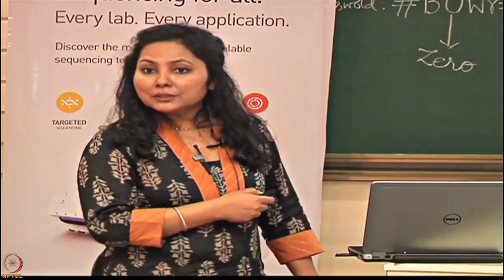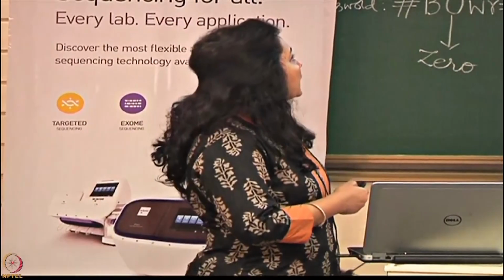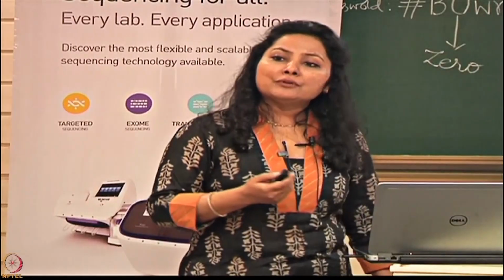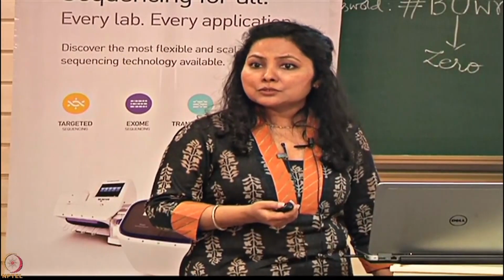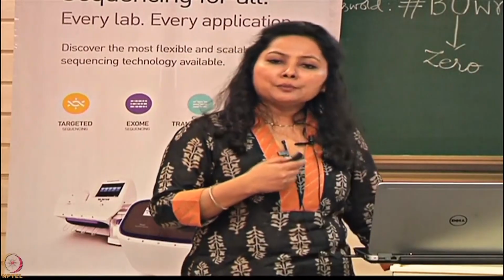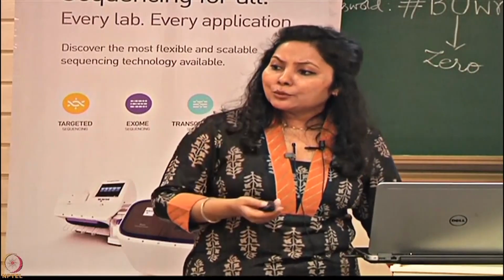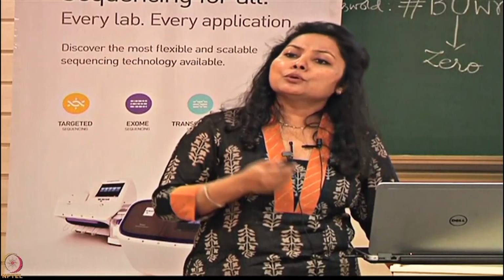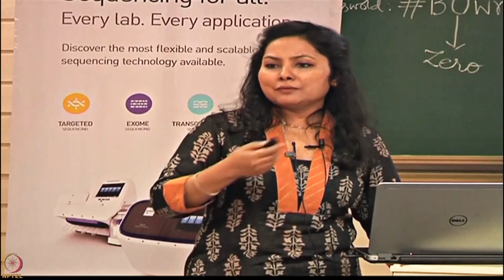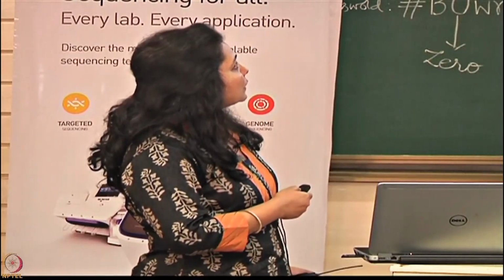Till date, this has been the gold standard technology for things like targeted work, where you have certain amplicons to be sequenced, or a de novo organism to be sequenced to fill up assemblies. Then there are multiple fragment analysis applications wherein you are not actually sequencing the fragment, you are just looking at the size, and based on size polymorphisms, you are giving certain scientific answers. So this is about the capillary sequencer.